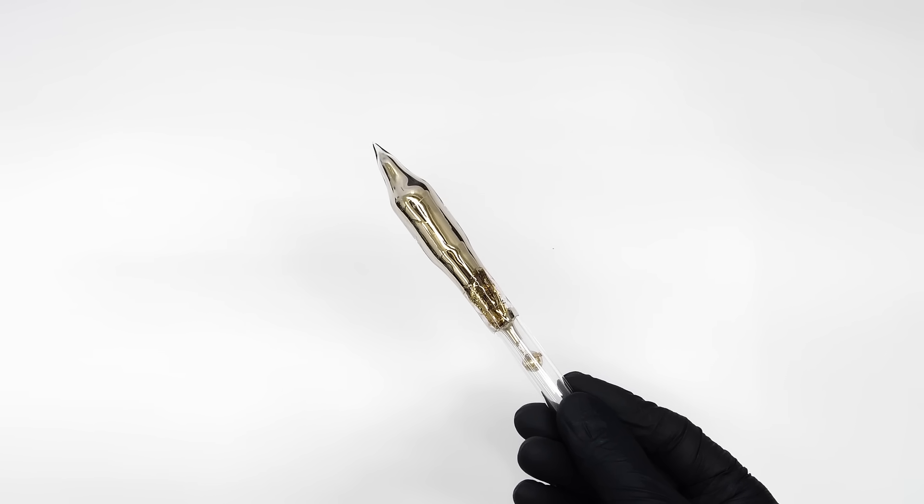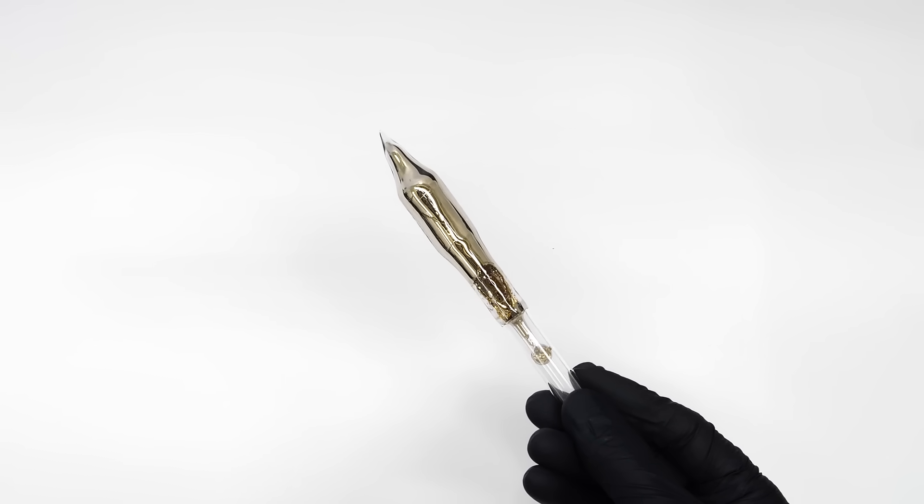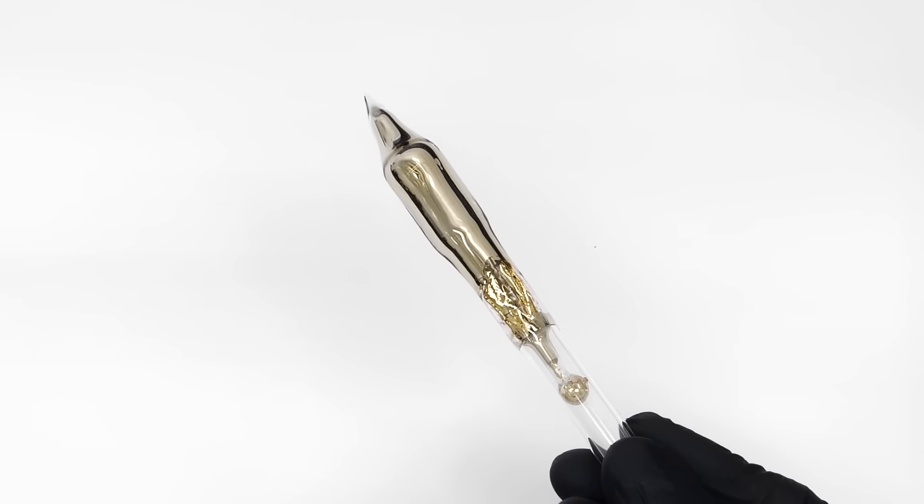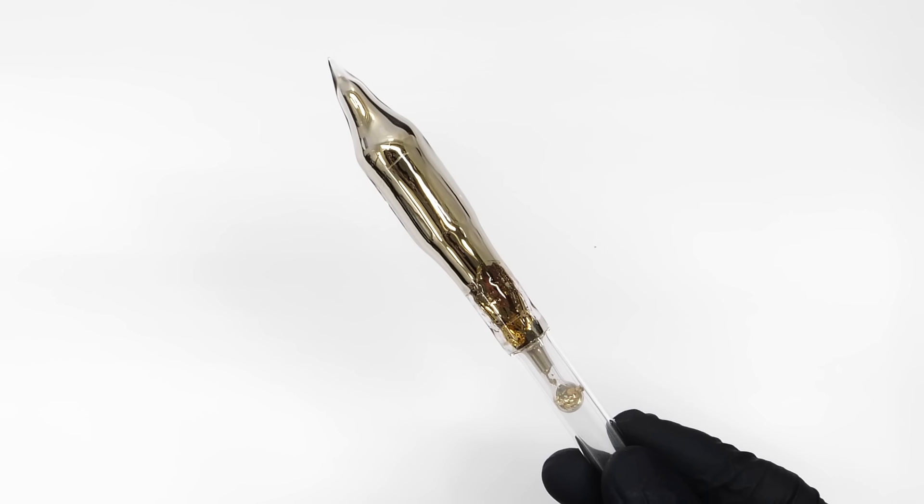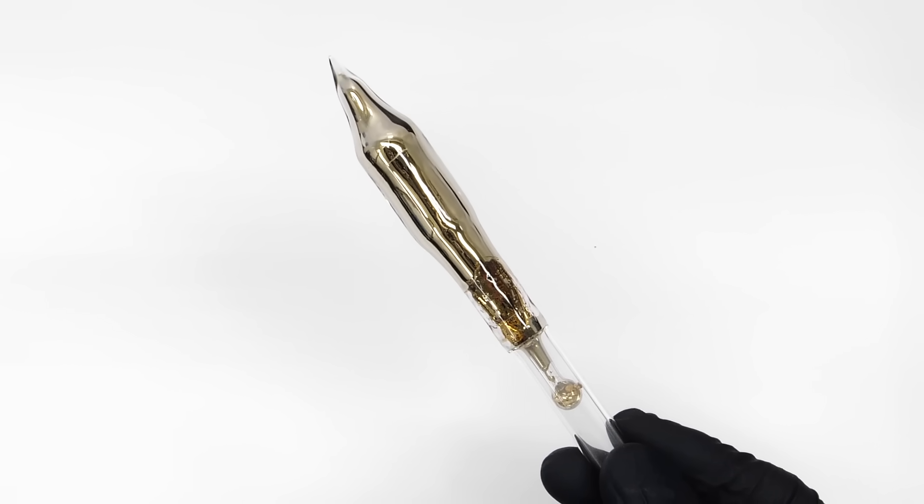This is very similar to potassium or sodium, but it's even more reactive. It's kept in this glass ampoule to protect it from air, and having it break open could be really dangerous.